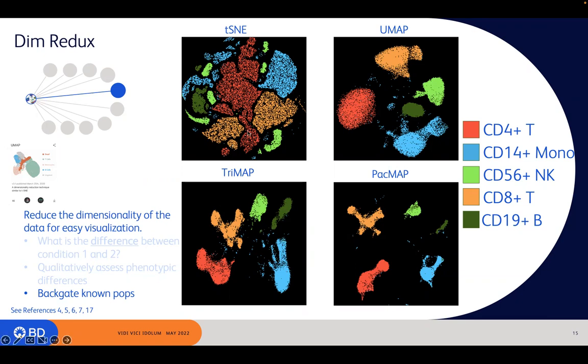Now, in contrast, t-SNE doesn't do that. t-SNE doesn't care about the white space insofar as it doesn't try to put groups of cells that are very close to one another necessarily close together in t-SNE space. So for example, again, looking at the same data set, your CD4s are in red here, but you can clearly see that there are populations of this CD56 NK cell subset that are very close to the red blobs that you see going down through the middle. Just by glancing at this, you would think, if t-SNE was preserving global structure, that NK cells and CD4 T cells have a lot in common, when in reality they don't. So that's the difference in terms of the projection and what they do.